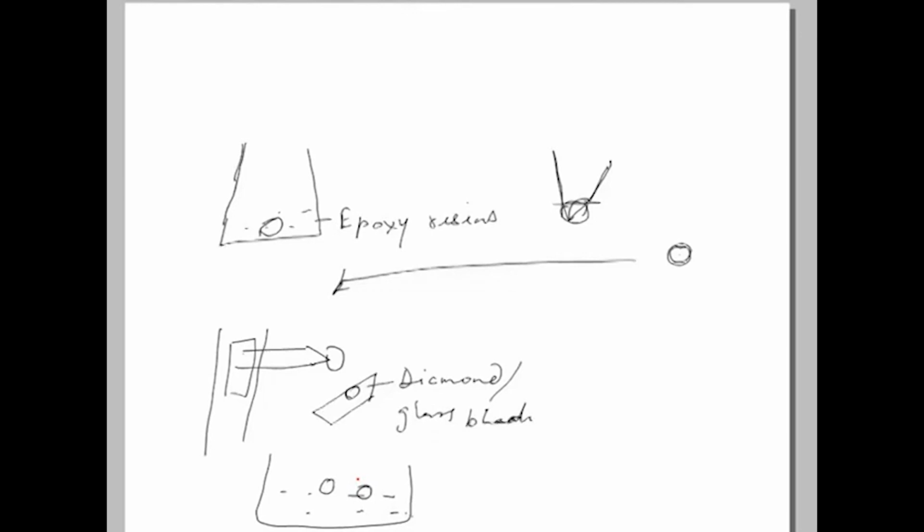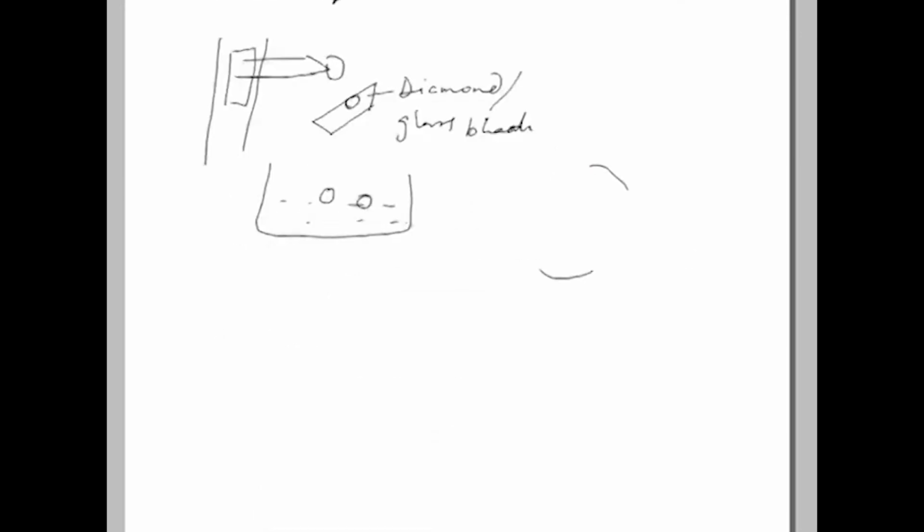Now, this specimen holder, which is a specimen grid, will be a circular 3.05 millimeter grid with a mesh of copper or some other metal. It looks something like this which has a mesh size, and a specimen will be put in at these mesh, and this will have a holder here. Now, these are again stained in here, and once these are stained and dried and then finally rinsed with distilled water, they could be placed into the electron microscope for viewing. So, that is how the whole thing works.